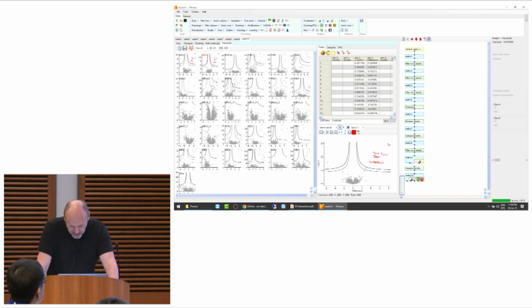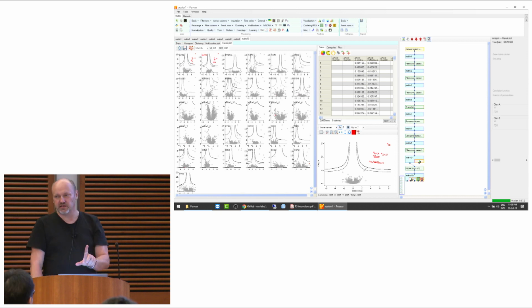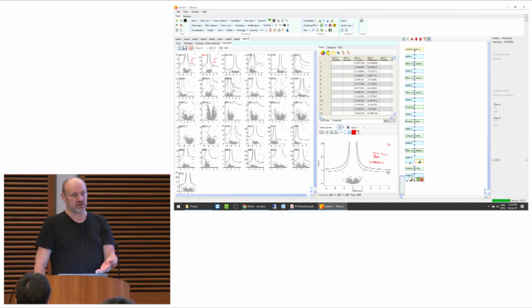So you can, for example, select all your class A interactors of APC2 and see where they appear in the other volcano plots, right? So you see that's also interactors of APC1, many of them, for example. But otherwise they don't appear much. So that's a nice thing here, that you basically can immediately, in one view, see for the whole data set that you did where a certain protein class, for example the interactors in one volcano plot, are appearing.